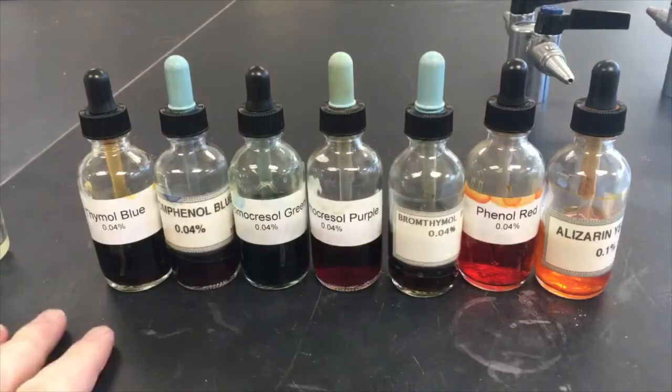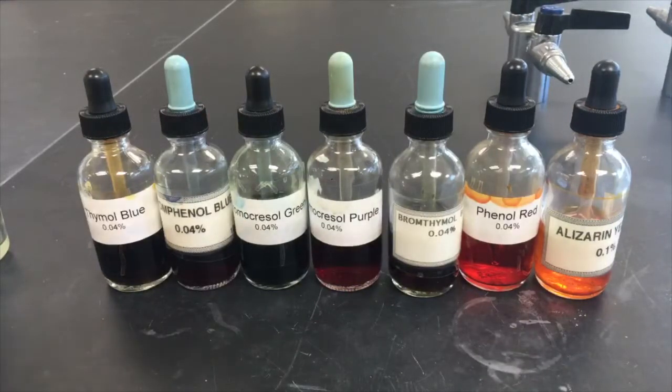Here are the seven different indicators that are going to be used: thymol blue, bromophenol blue, bromocresol green, bromocresol purple, bromothymol blue, phenol red, and alizarin yellow.